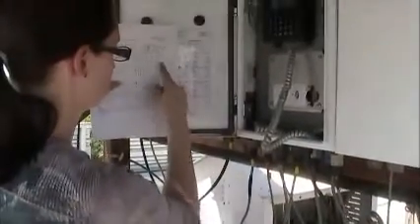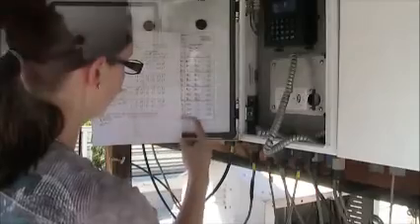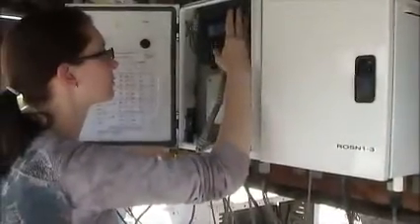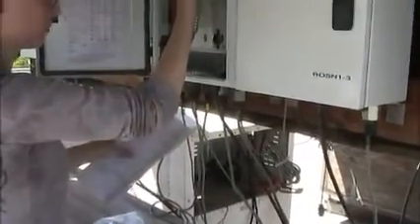The week 2 sample change is very similar to the week 1 sample change. Fill out the final readings section of the week 1 log sheet and check the values to make sure that they are within range. The controller will not ask you to change the flashcard at this time. It will prompt you to install the bag with today's date. Make sure to check the date on the week 2 log sheet to make sure it matches the controller's display date and the date on the front of the box.